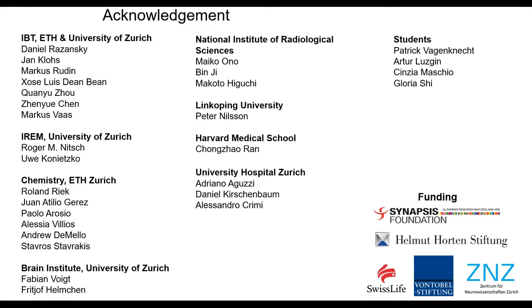I think there's one final question, actually just a clarification. The skin and skull were intact in your models? So for our imaging, because the mouse we use is black, we have to shave the mouse. If the mouse doesn't have a strong pigment in the skin, then there's no reason to open the scalp, and the scalp does not interfere with the signal acquisition or the signal quality.